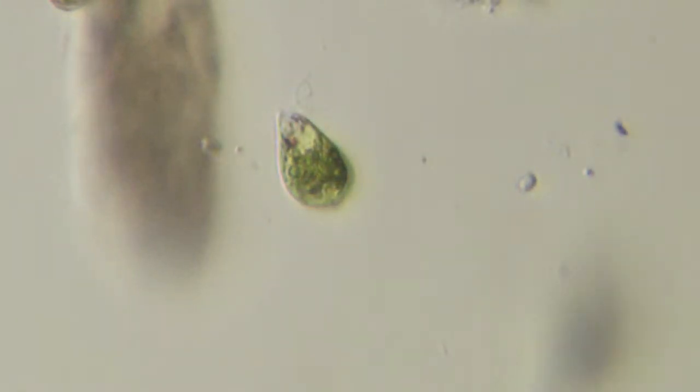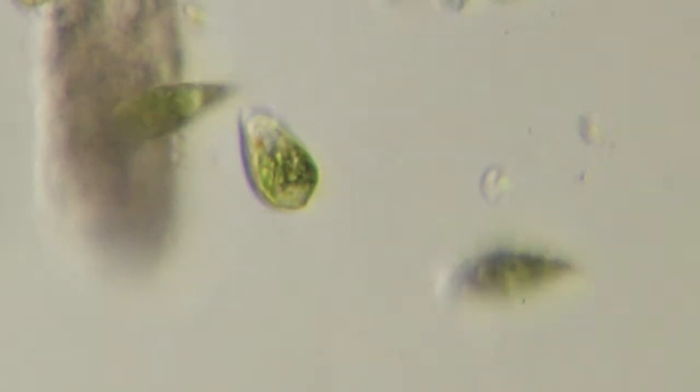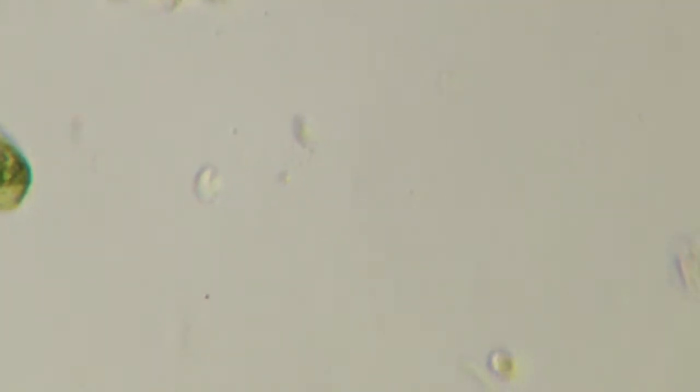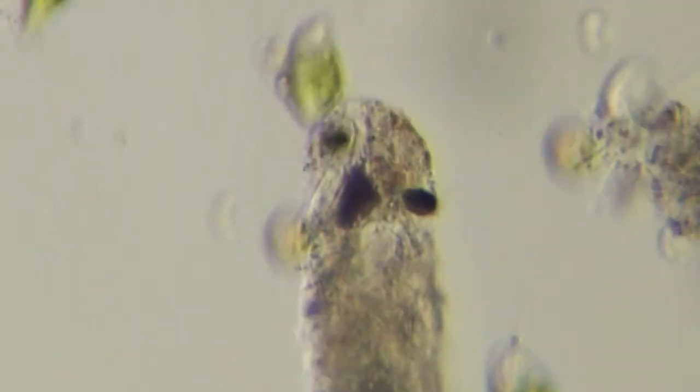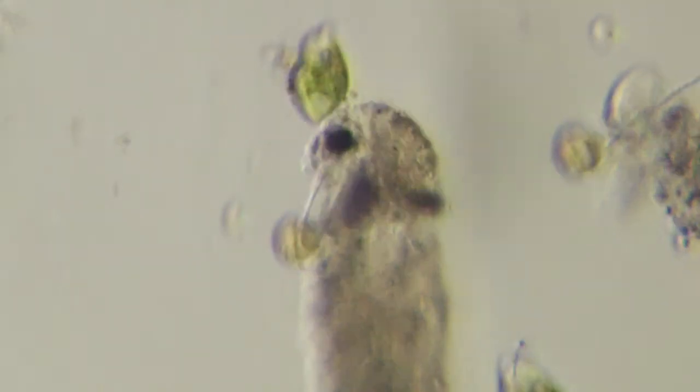So if I can get one to stay in focus as it's cruising by and tumbling, you can really see the 3D. You can basically see the chloroplast inside tumbling around inside like a tombola, one of those things they use for lotteries and stuff with the balls inside. It's really cool. Find a spot and just hopefully they tumble in focus and just stay here for a bit as they swim by.